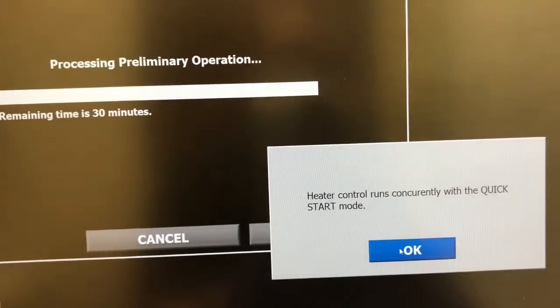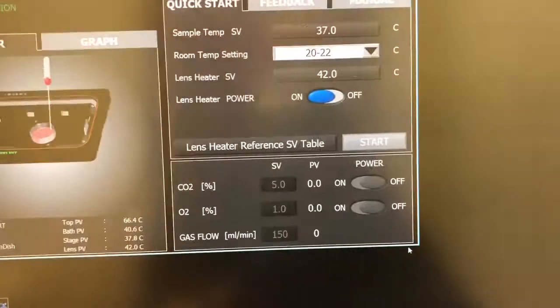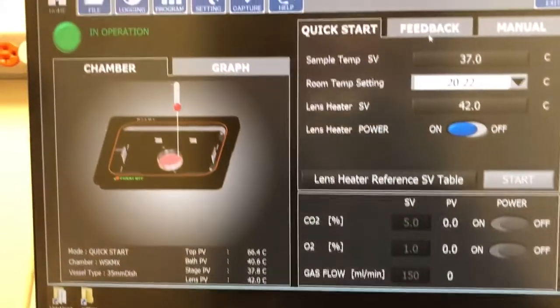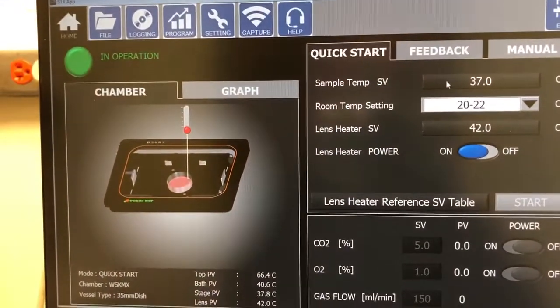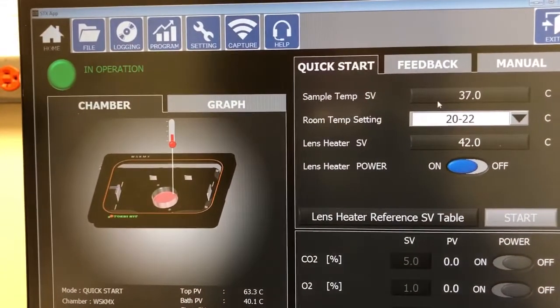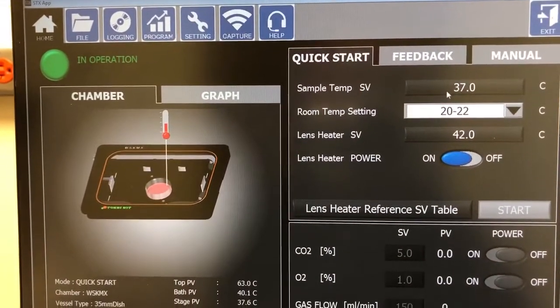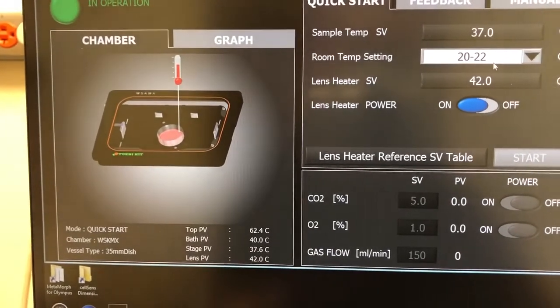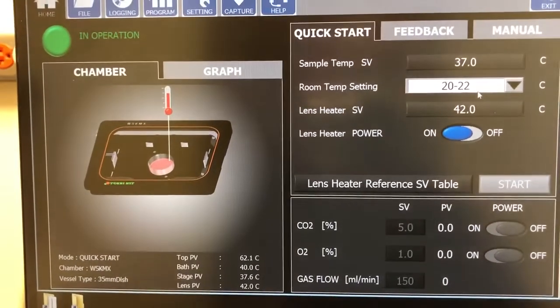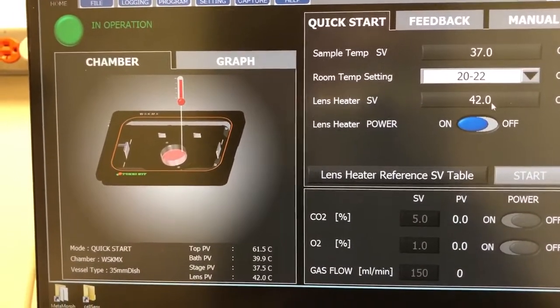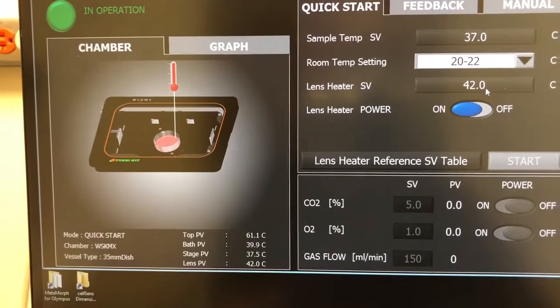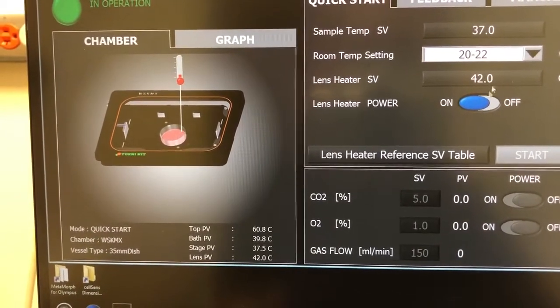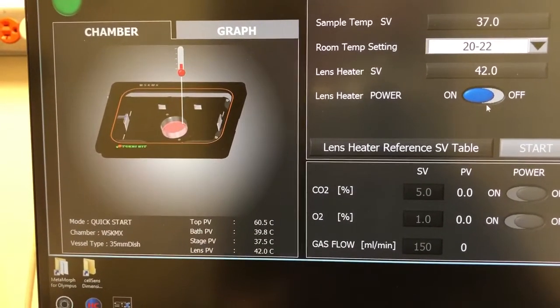And it's going to run in quick start mode. And so here are the settings. We need the sample temperature set point to be 37. The room temperature setting, 20 to 22. The lens heater, we usually use it at 42. And the power is on.